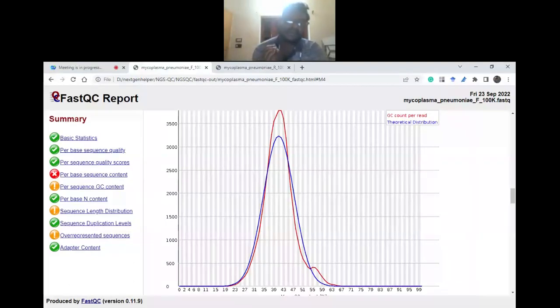Sir, but when we are performing these quality parameters, our gene of interest will be separated from the rest of the data set, but my gene of interest will be in that low quality score. So what will be the optimal strategy for extracting those GC rich genes?